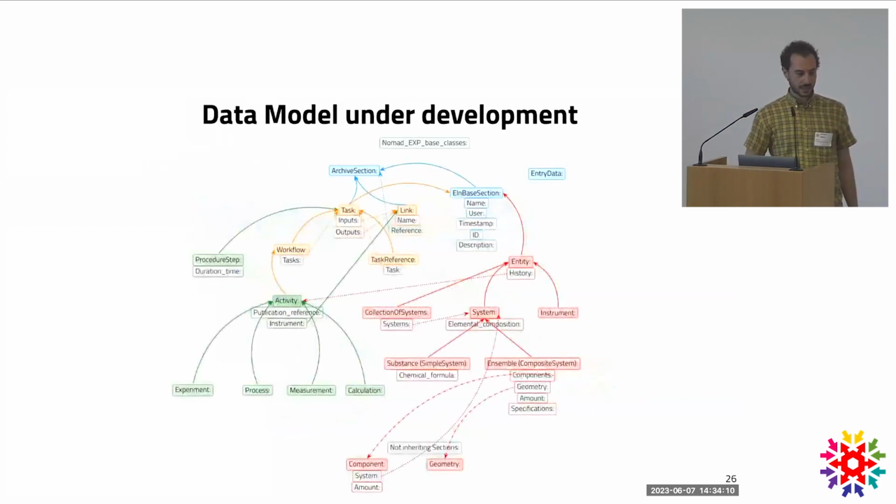This is just an example slide, and the data model that we have so far is probably outdated, but I don't want you to go specifically into the structure. It's just to say that it can acquire a pretty complex structure, and we can have several kinds of operators connecting it.